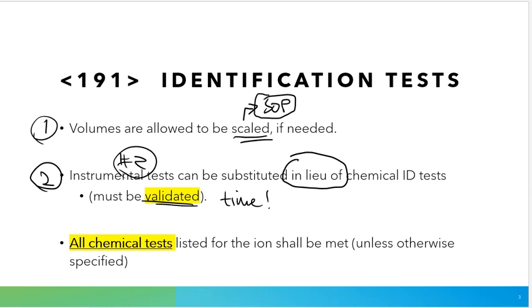On the other side, if we've got tons of different samples to process, then that's a lot of stuff for me to keep up with. So the instrument pieces will actually be more convenient in that manner. This would be great if there were tons of samples submitted to the lab that maybe all need a chloride test in this particular example. Then we can just run everything on the instrument all at once, and I can walk away from it and do something else and then come back to that instrument once it's finished.